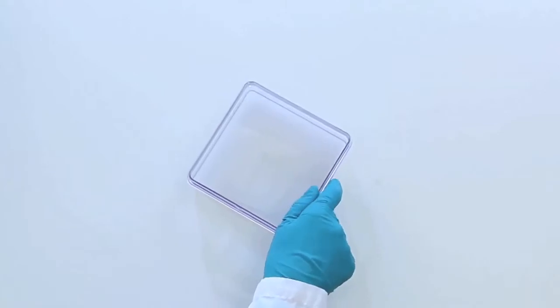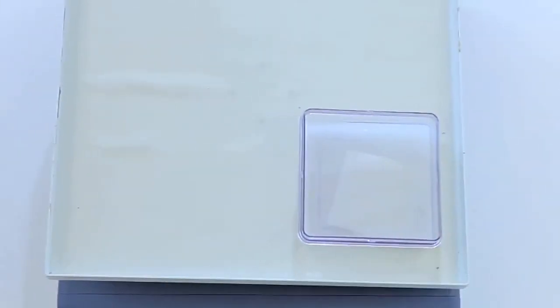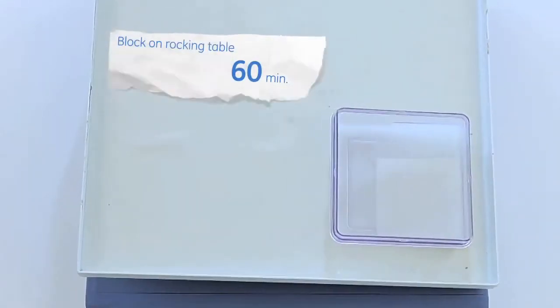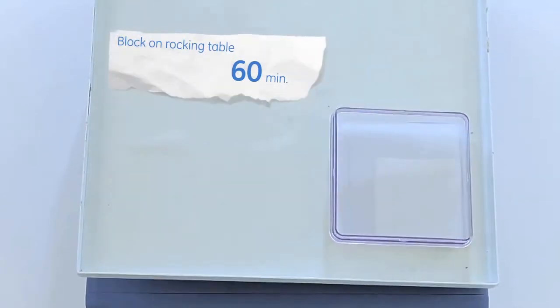Next, block the free sites on the membrane using ECL Prime Blocking Reagent which is compatible with your other reagents. Add the blocking agent and place on a rocking table. Blocking normally takes one hour at room temperature.